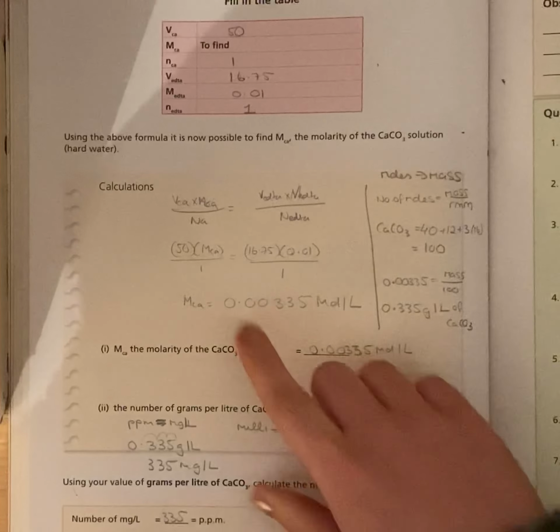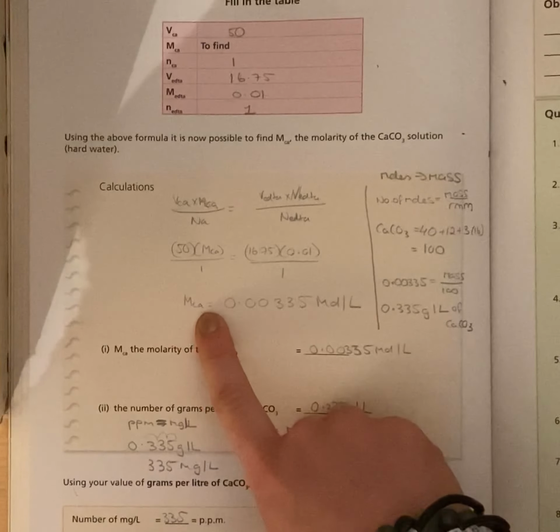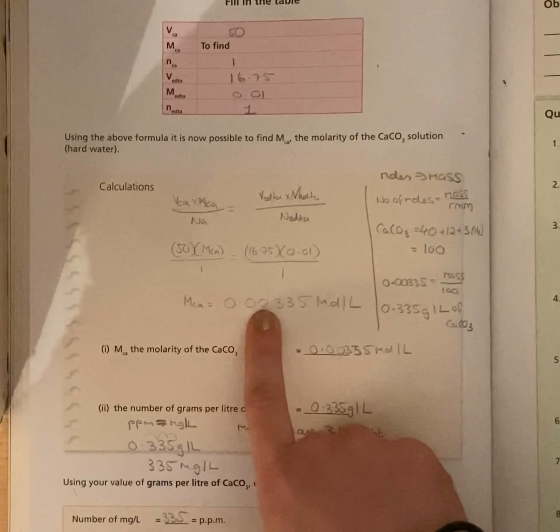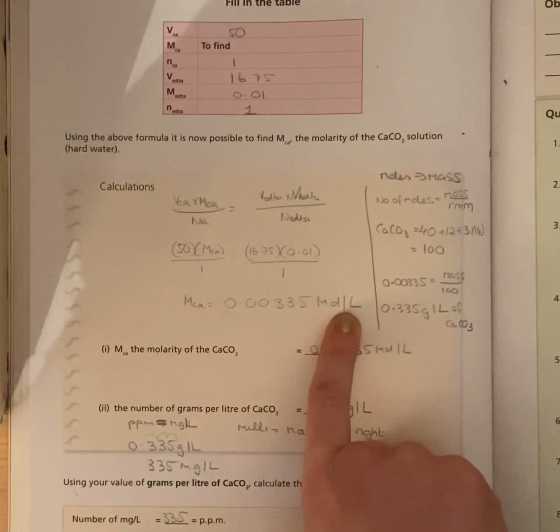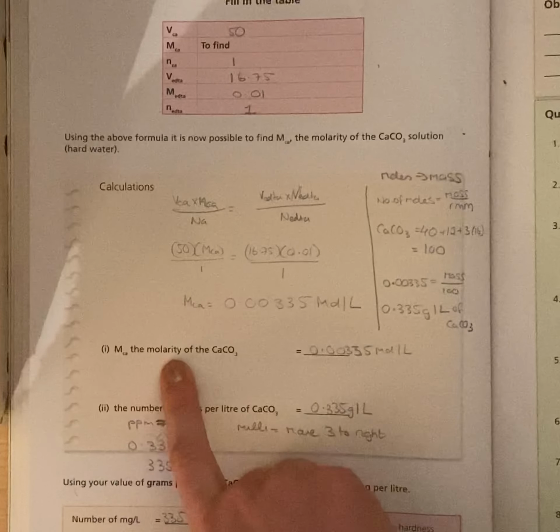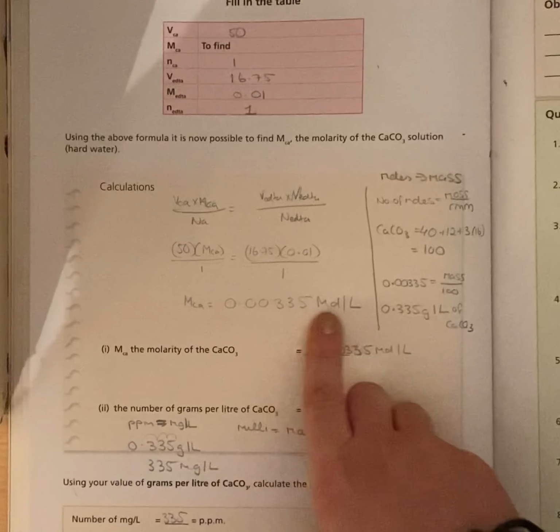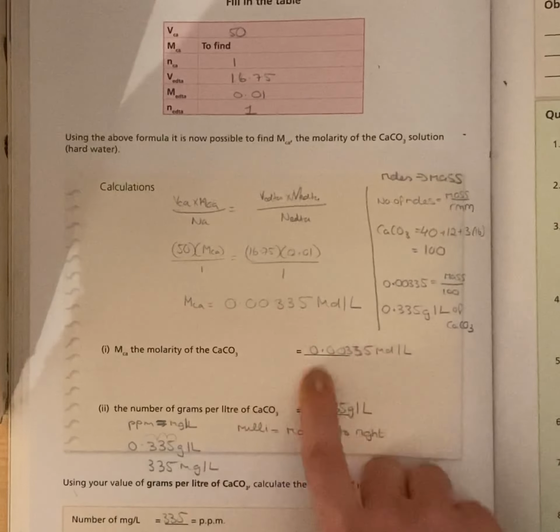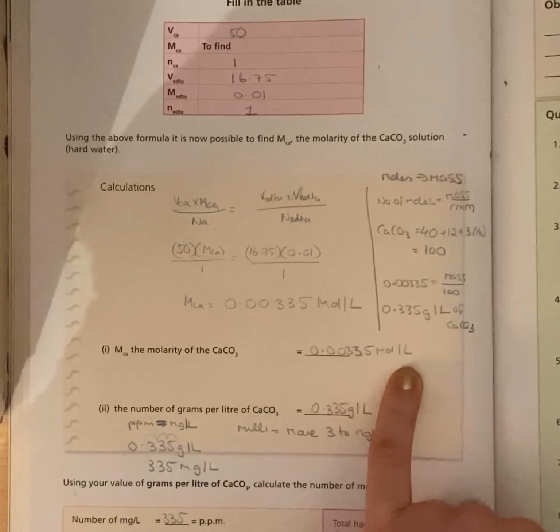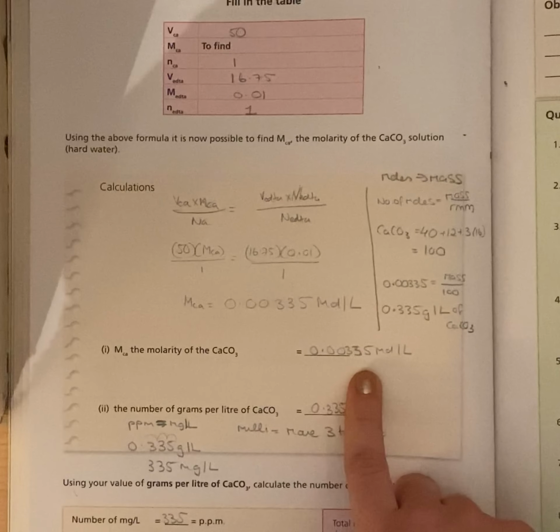So once you put all of that into your formula, I got the molarity of the calcium to be 0.00335 moles per litre. So it's asking you to find the molarity of the calcium carbonate, and that should be the exact same answer. So whatever you get up here in your calculation is the answer here. So this is the molarity of the hardness of the calcium within that water sample that you have, which will link to its level of hardness.